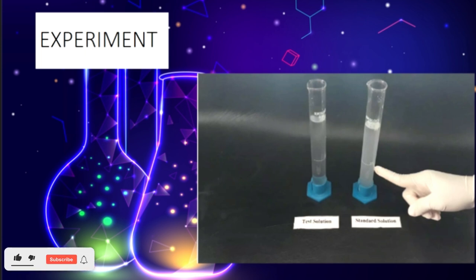Then we add the silver nitrate, so we have 51 ml of solution there. But here we add everything first, and only then make up the volume, so we have a total of 50 ml in sulphate, while there are 51 ml in chloride. This is the difference between chloride and sulphate. And as with chloride, we compare the opalescence here. So this is the procedure for sulphate.